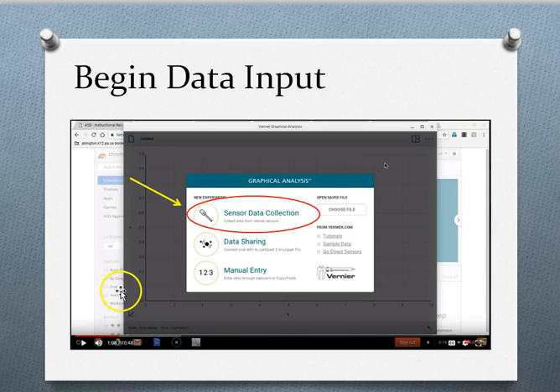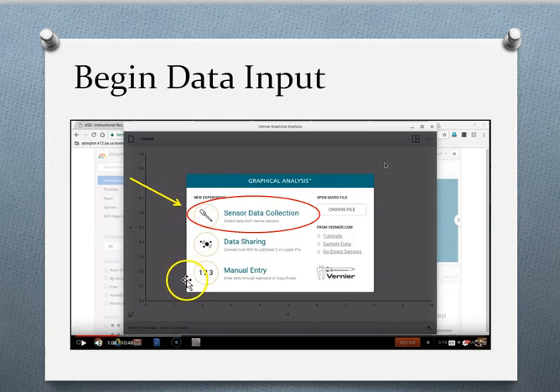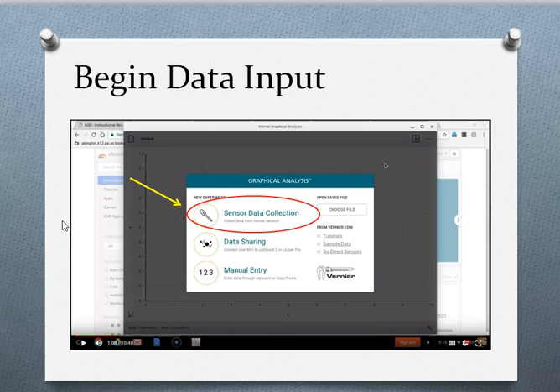That then opens up a screen and gives you a choice of three different modes. When we're in Lab, you're going to be using the sensor data collection and you'll actually attach your sensors and start collecting data. I'm going to go into manual mode and open up the app in real time, cut and paste some data in, and show you the finer points of how to use the program.